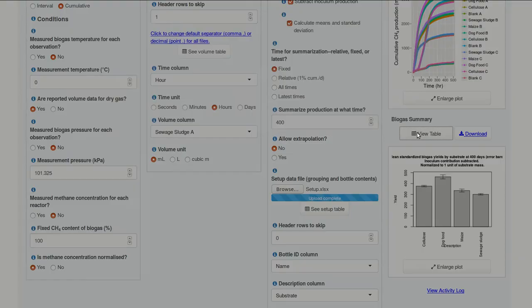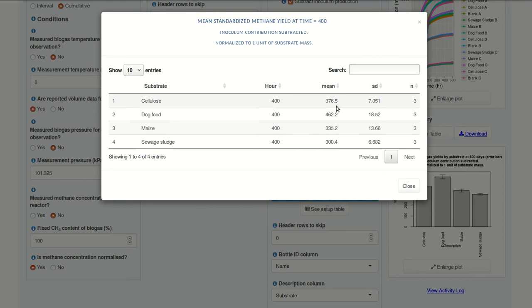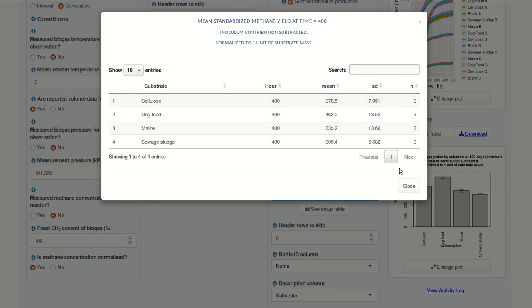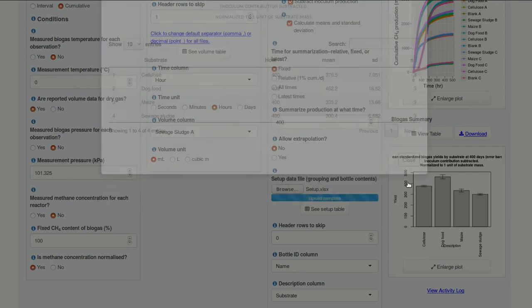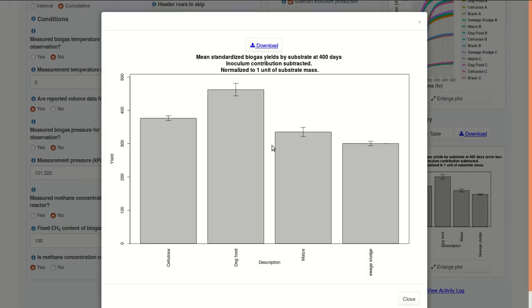We get BMP results for 400 hours. And we can see cellulose is close to 400. It should be close to the theoretical value of 414 milliliters per gram VS. Perhaps 413. Dog food has the highest value here. So, we've selected 400 hours. You can also take a look at a bar plot that shows us the means and standard deviations.